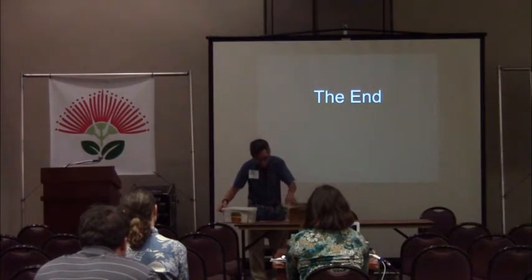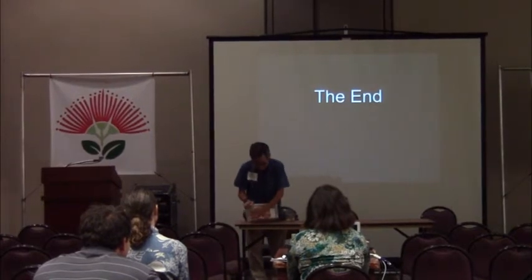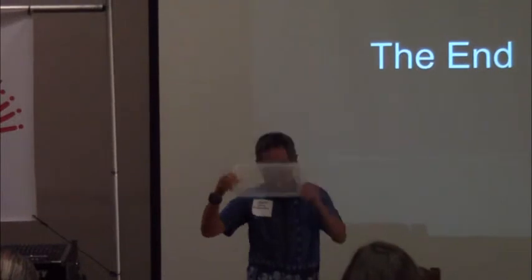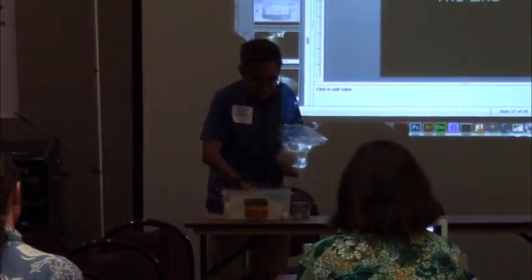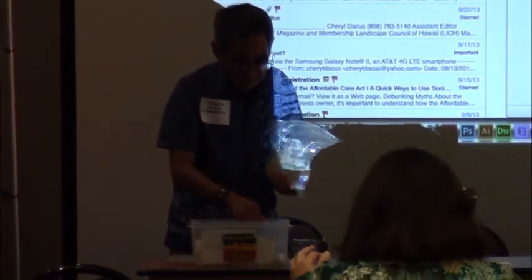This, to my knowledge, is the world's smallest seed bank. A Kew Garden miniature seed bank, and all it is really is a plastic box and airtight lid. Instructions, you can get instructions online. Got some desiccant, silica gel. Got some small dishes for drying the seeds. Small plastic containers for storing.